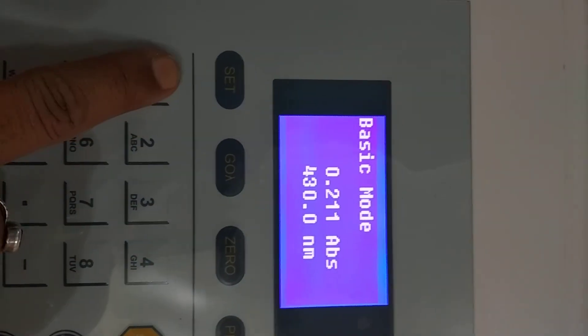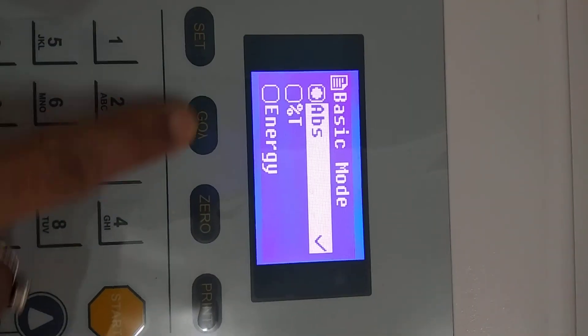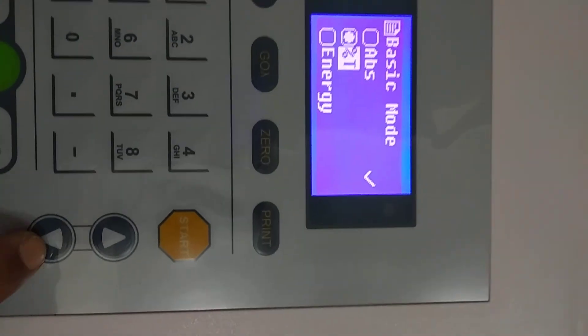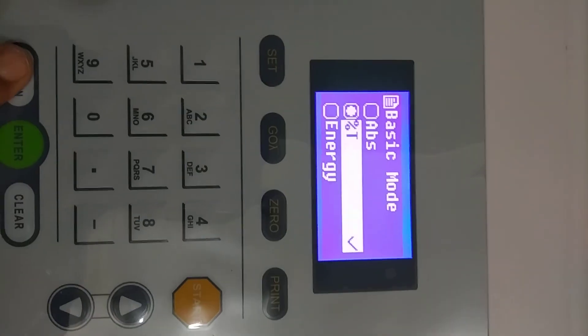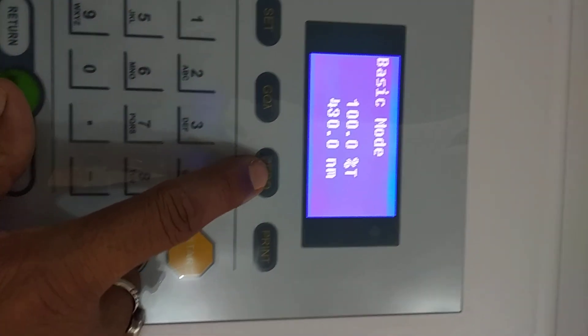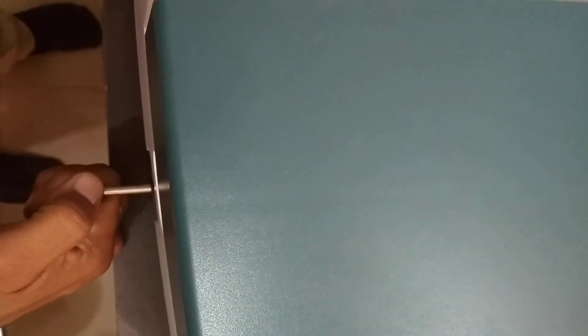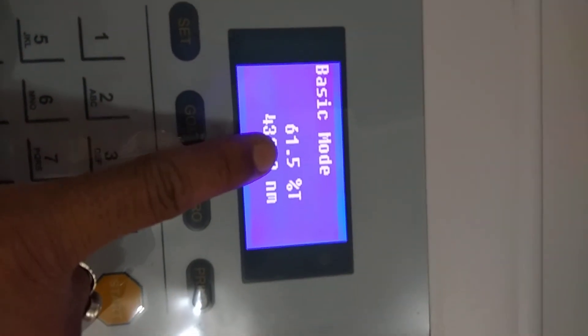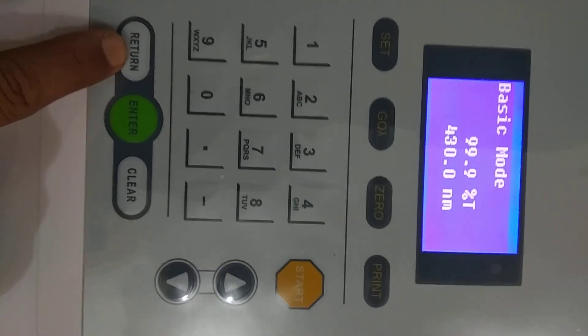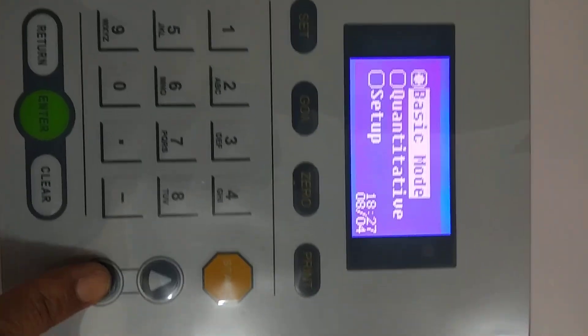For Transmission Mode, the procedure is the same — only change the mode by pressing the Set key, then Down, then Enter, then Return. First slide to the reference solution, press 0, then slide to the sample. The calculated transmission results will be displayed on the screen.